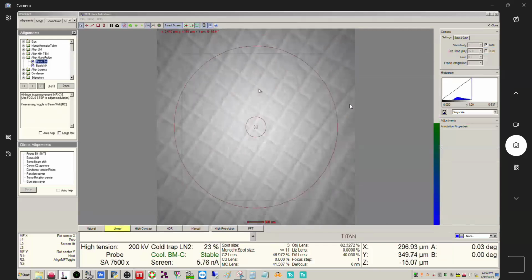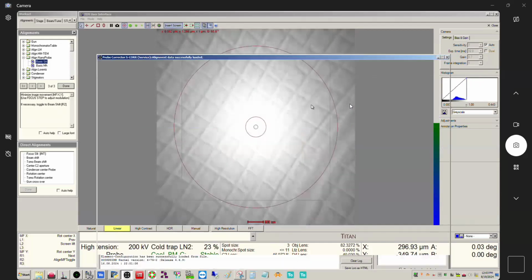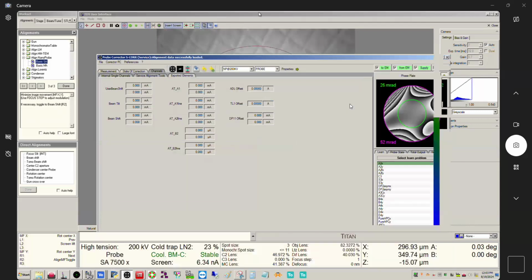So in a lot of ways, what you're doing here is going through, because we have the corrector, and you're just kind of resetting everything inside of SCore, okay? All right, so we are good to go there.